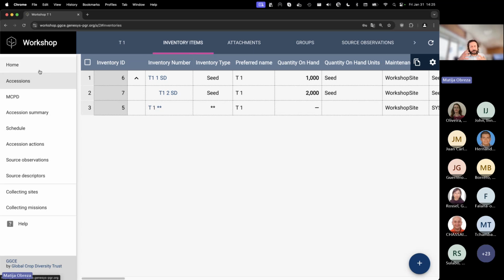So managing field collections, seed, pollen, DNA samples, all of those things are doable with this same concept, because the material you physically have is what gets recorded in your inventory, and anything that moves together as one unit, let's say a bag of seed, is one record in the database. If you split the bag of seed into two bags, or extract some seed and put it in a different bag, that new bag is a separate inventory. It has its own number, its own barcode, because that bag as a whole, with thousands of seed, can move around and carry those thousand seeds.